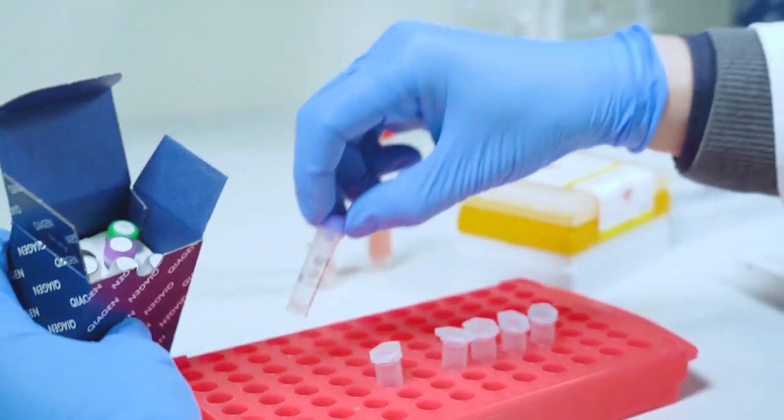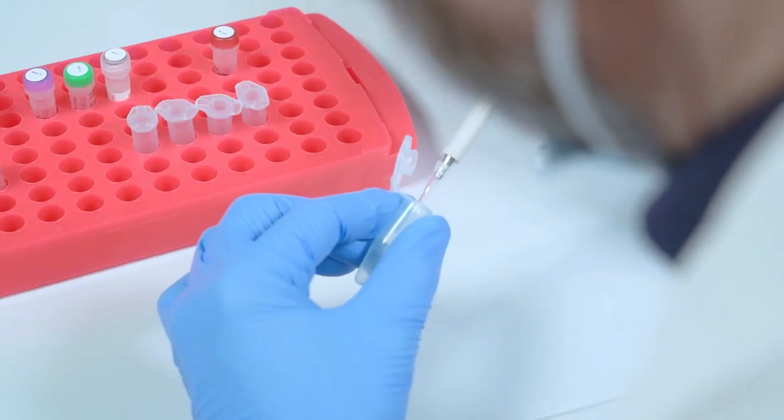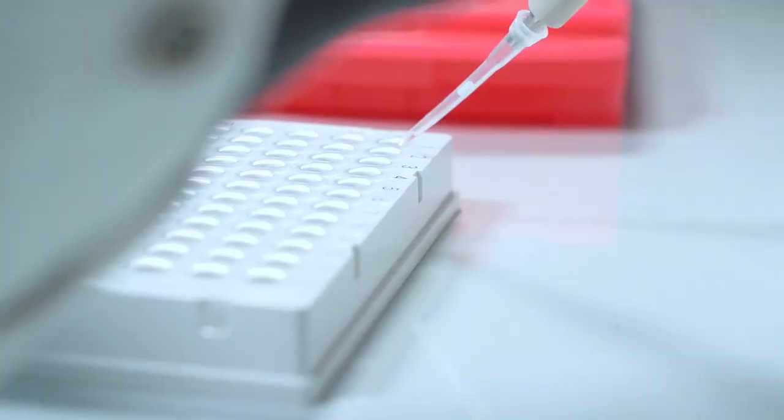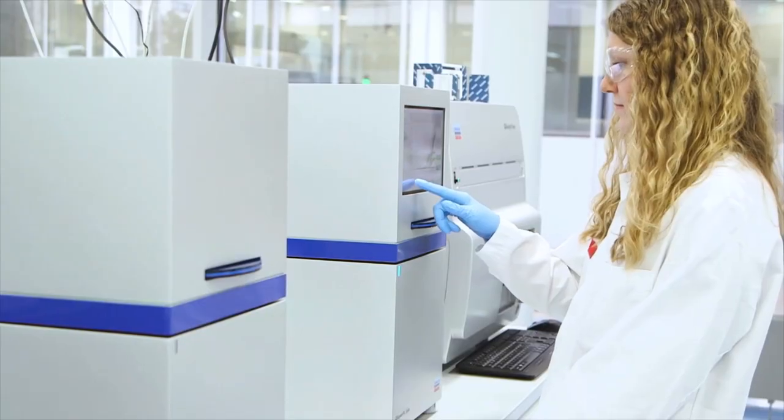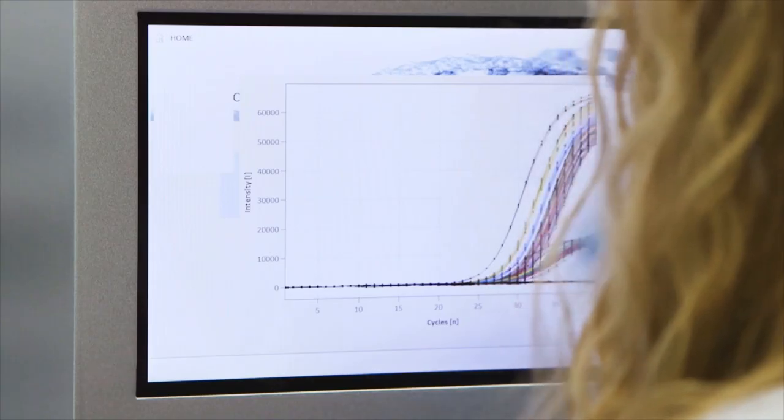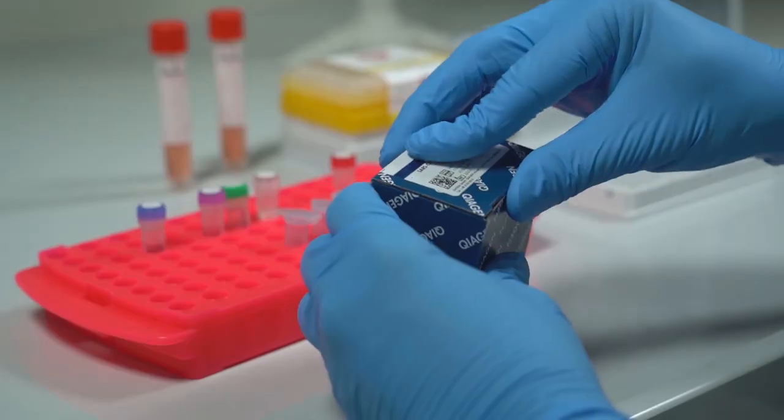We have streamlined the gold standard in sample preparation to a liquid-based approach completed in two minutes to enable a fast real-time RT-PCR run on any cycler delivering results under one hour. And all this in three simple pipetting steps.